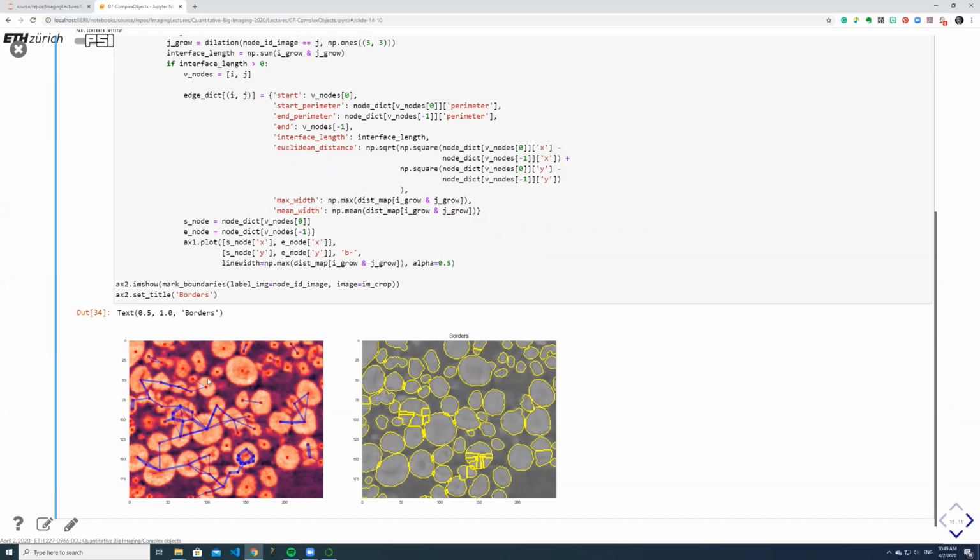So that also gives the message that if you have 3-dimensional information, use it, because you will otherwise lose relevant connections that are really necessary to make conclusions about the data you have. And the good thing is the watershed segmentation is easily expanded into any dimension, actually.